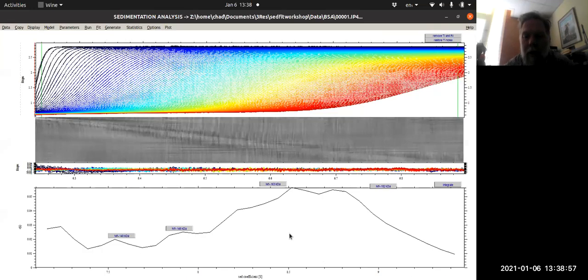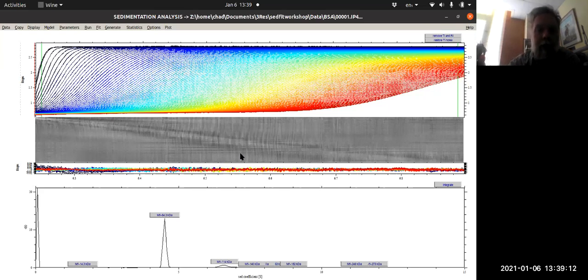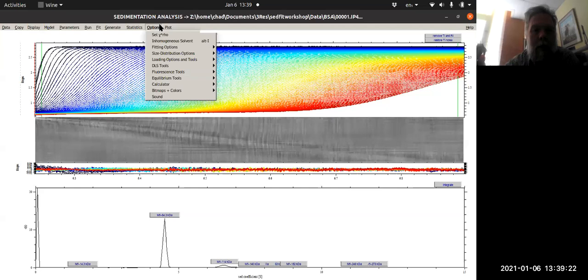It gets really ugly down here, I guess. I have too many data points. Maybe I should smooth it out again. But anyway, if you zoom out all the way, if I wanted to assert that BSA is not glycosylated and it doesn't have any polydispersity, it should be 66,034 Daltons exactly, with enough deviation, except maybe it doesn't matter.